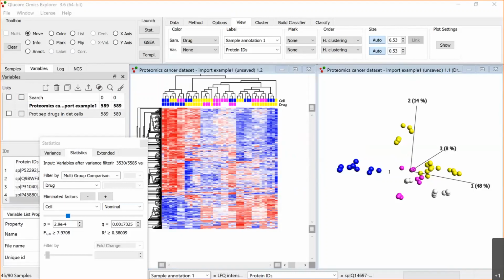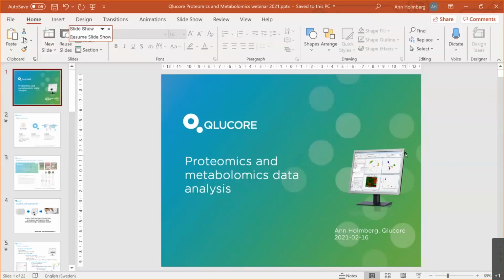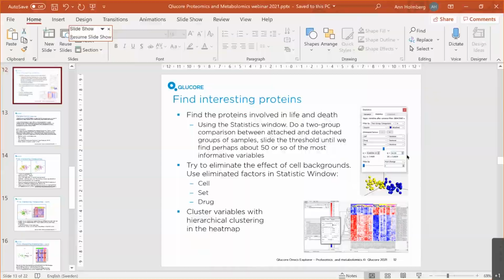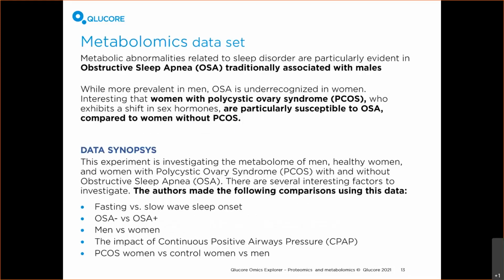Okay, any more questions? No, then we continue. Just when I send out the slides, I will also include a lot of the steps that I show you. So there are more slides in the presentation that I send to you than what I'm showing now. So now we move over to the metabolomics dataset.